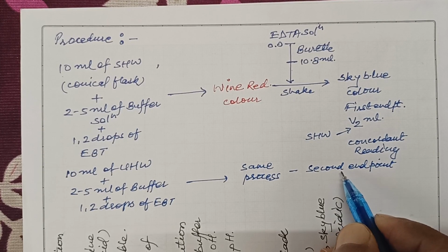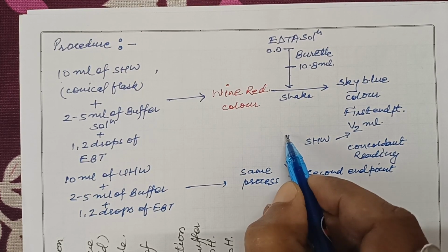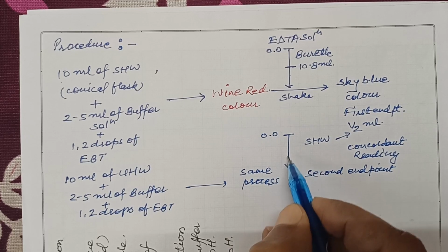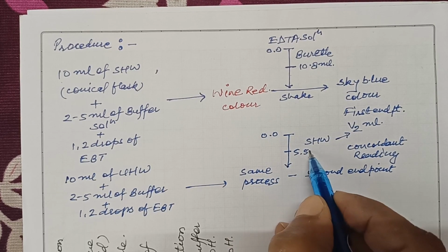Suppose the second endpoint is coming 5.5 ml.